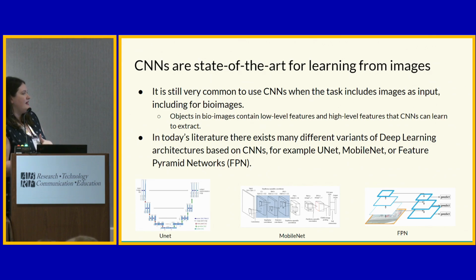But typically, again, transformers are starting to catch up, but often we are talking about what's called a convolutional neural network, or a CNN, and UNet is still the most common one. And I think that's great because it's one of the few architectures that actually came from biology back into computer science. It was not the other way around, which a lot of other tools are, coming from computer science first, which is fine, but biologists do good science too.